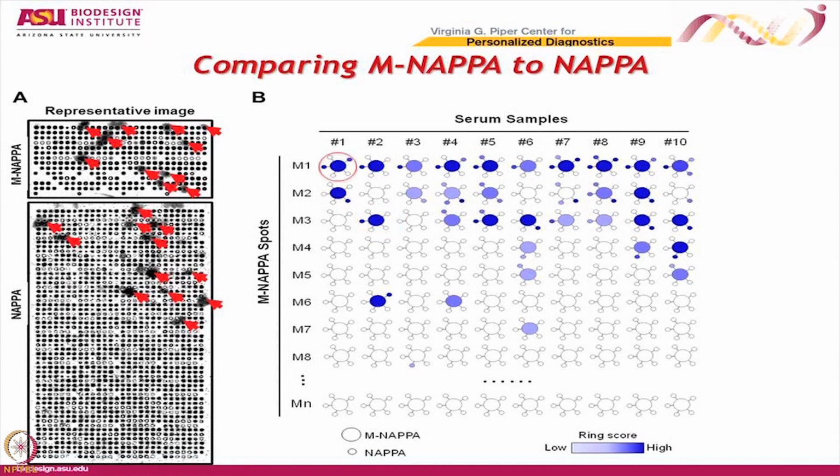Then here's another example where we had a strong spot signal, and there were 2 positives in that image. So that's something that you have to keep in mind, is that up until now I've been acting like within every mixed spot there's only 1 target. It's certainly possible that there may be more than 1. And obviously you hope that the mixed spot will give you that signal.